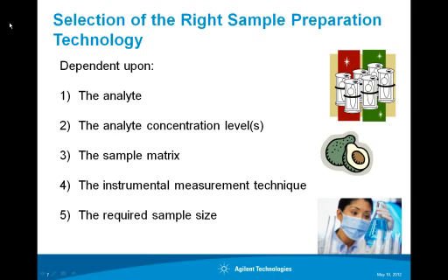When we think of sample prep, you have to be aware of 5 factors. 1, the analyte. What is my analyte? What is the concentration of the analyte or compounds that I need to achieve?